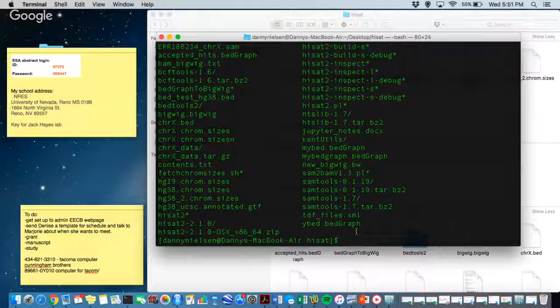So a bed file gives coordinates of regions of genome. BedGraph files give coordinates of that same information, but an additional column can be a number. And so this number may help to show coverage depth of sequencing over a genome. So they're similar type of files, but to make the bigwig file, you have to make the bedGraph file, at least from the resources I looked at. That was the kind of workflow to make it.